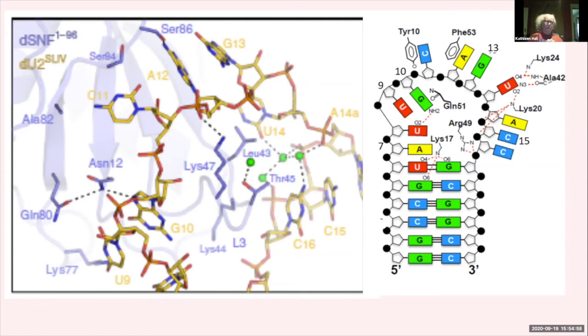So we've really relied on the crystal structures to help us figure out how this is working. But we've relied on the NMR to show us basically what I think is the mechanism of conformational selection and how that thing is working. So this is something that only NMR can give. So I obviously am very fond of it.